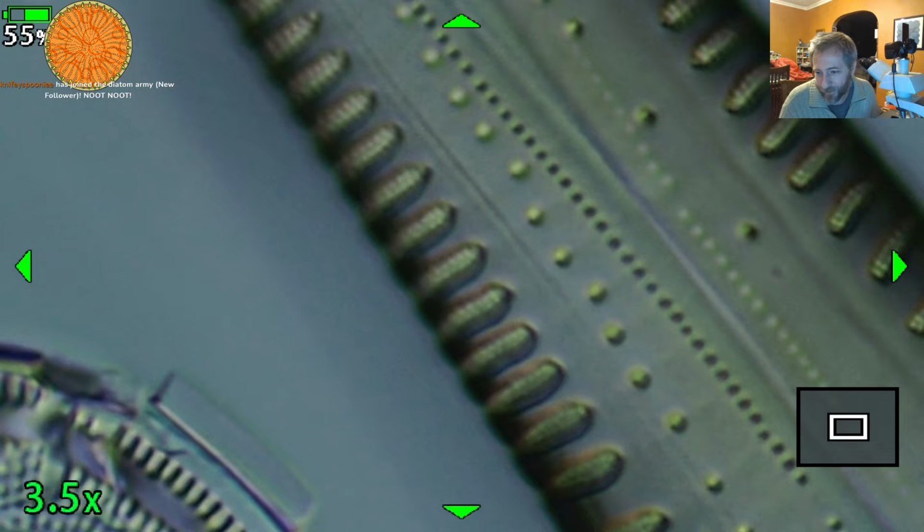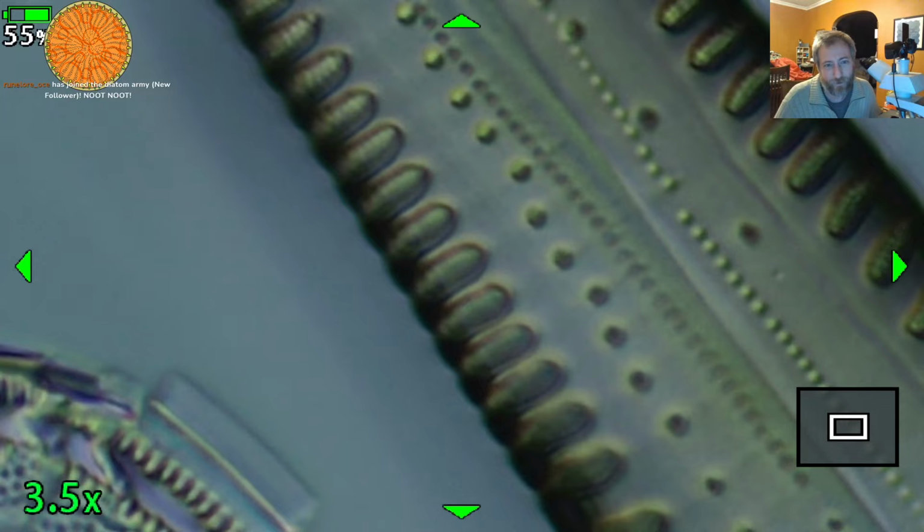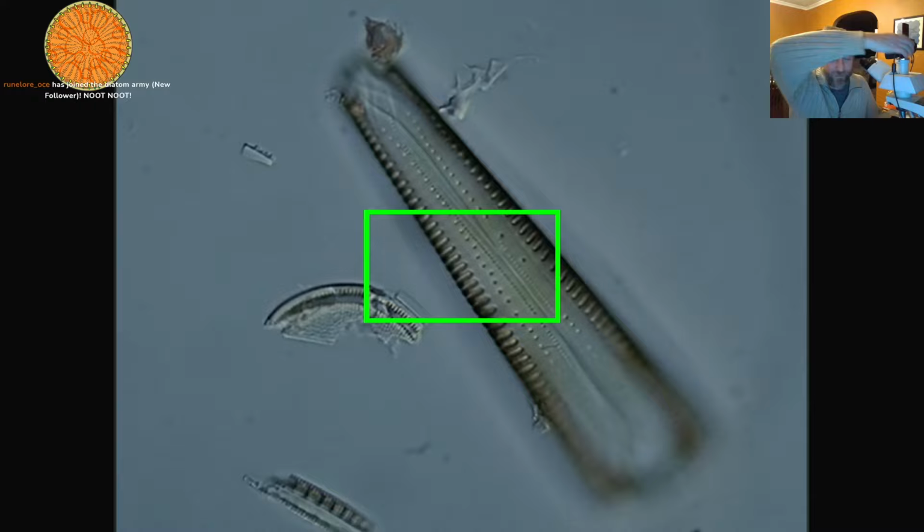We're looking at some super zoomed in versions of some diatoms from a hydro plant in Idaho. It was collected from Idaho and then sent to me by my friend Anna, who studies diatoms and works in Idaho. I think they were just sent to her for water quality analysis, and so actually what we're looking at is this thing. Ignore the big green box, that's my camera.